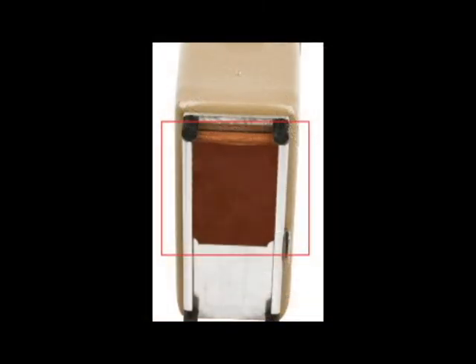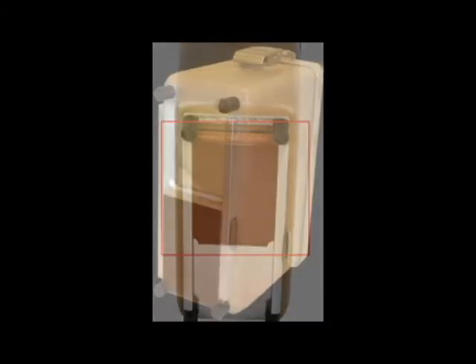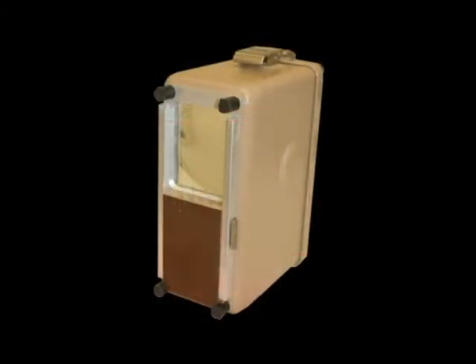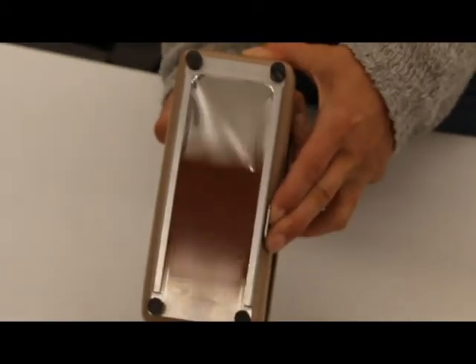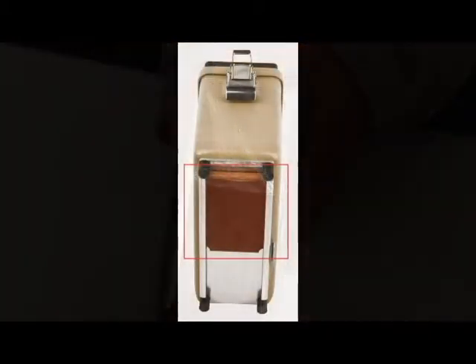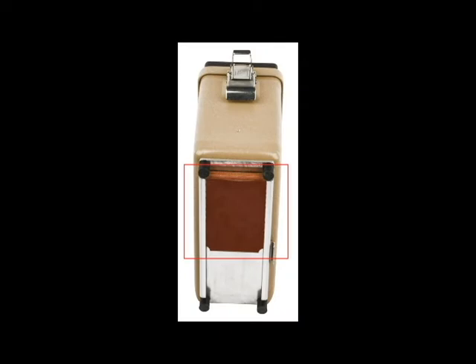The beta shield on the bottom of the meter can be opened to allow exposure to beta radiation through a window with a thickness of 7 mg per square centimeter. With the shield closed, beta radiation cannot be detected.